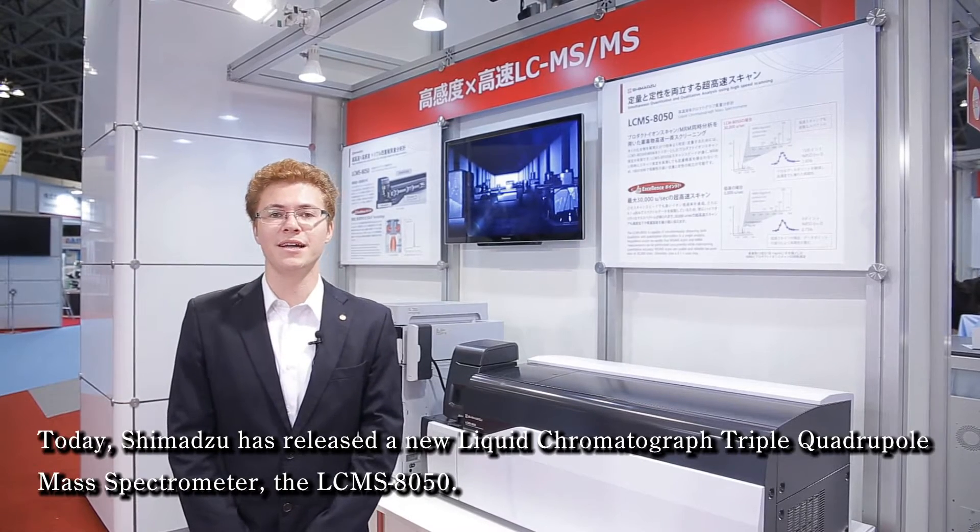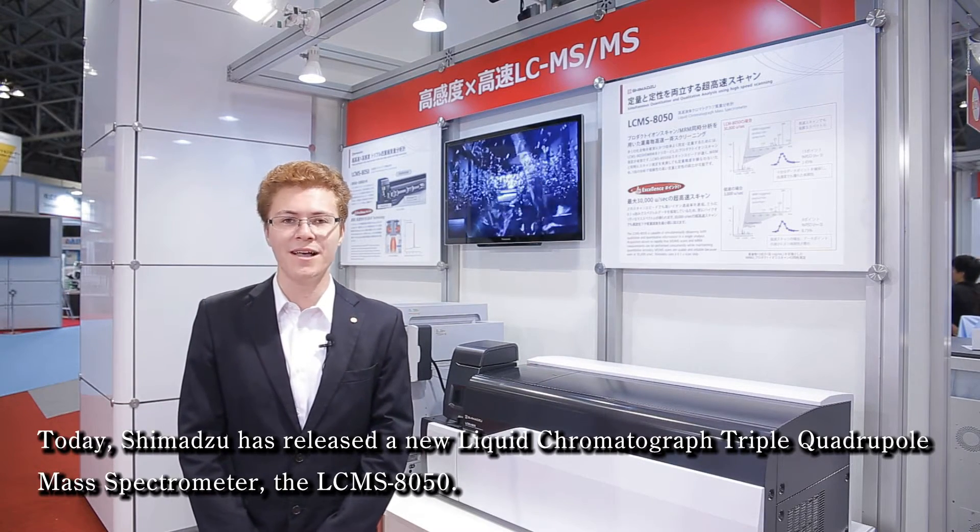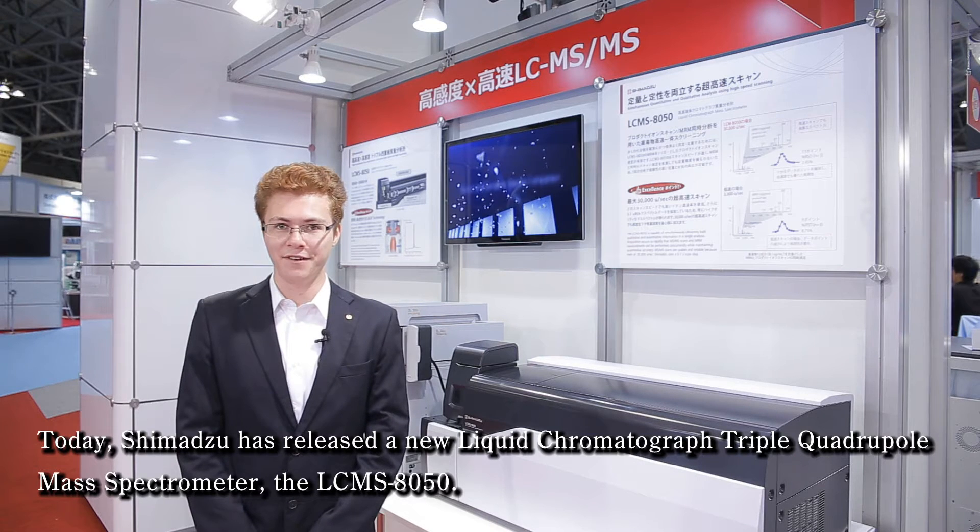Today, Shimazu has released a new liquid chromatograph triple quadrupole mass spectrometer, the LC-MS 8050.